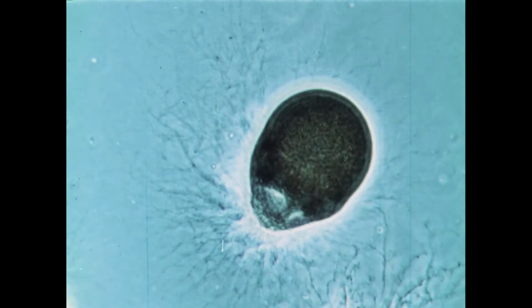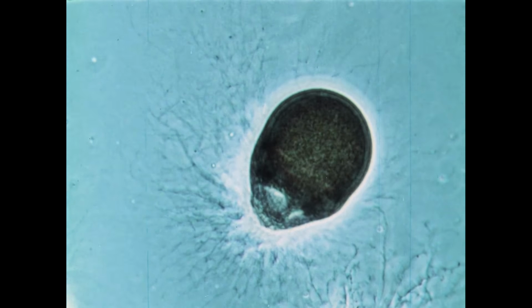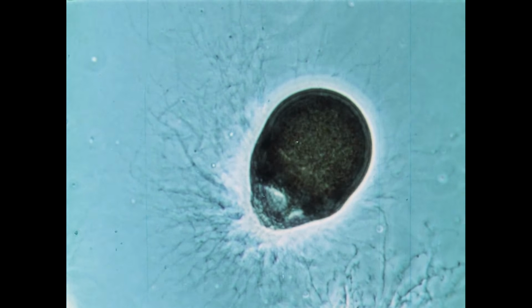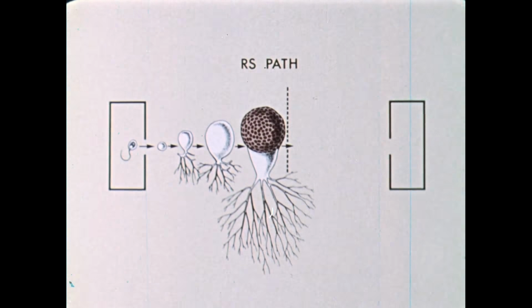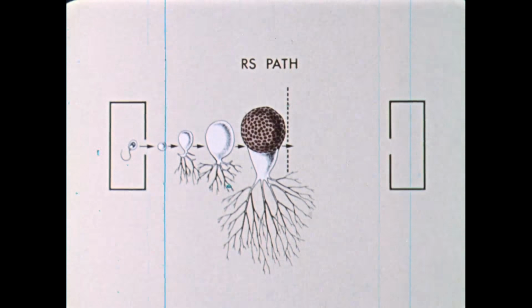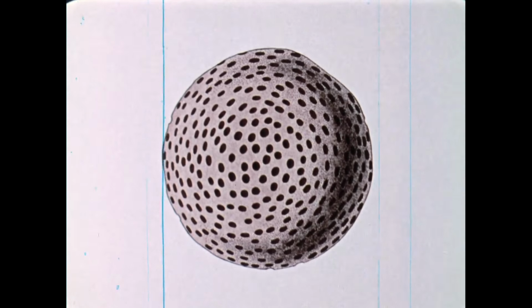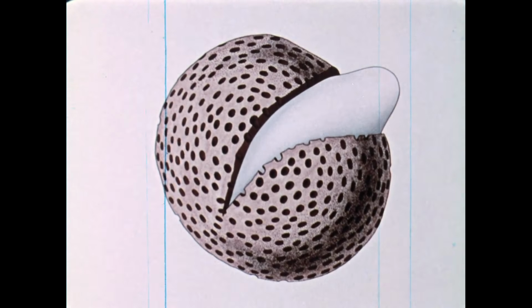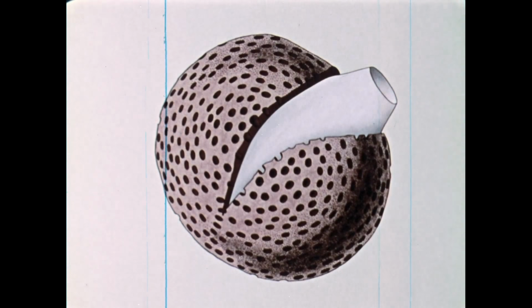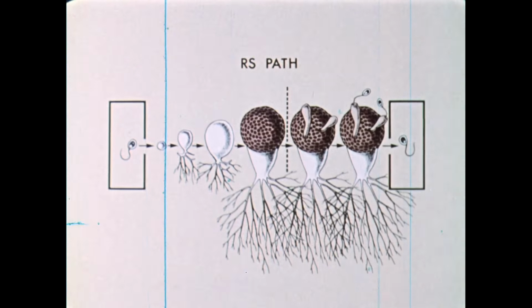In nature, the dormant resistant sporangium enables Blastocladiella to endure adverse conditions. Once a resistant sporangium has formed, it remains dormant and does not produce spores. But a resistant sporangium can be induced to make and then release zoospores if it is put in water. The outer thick wall cracks open, and an inner membrane extends through the opening to form a papilla. This dissolves as in an ordinary colorless plant. An exit pore is formed, and the spores are released.